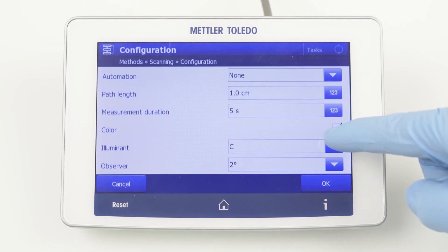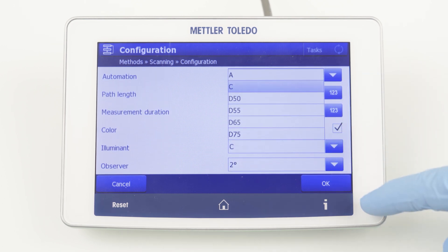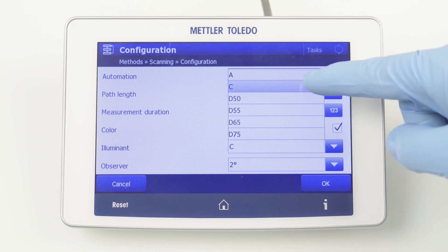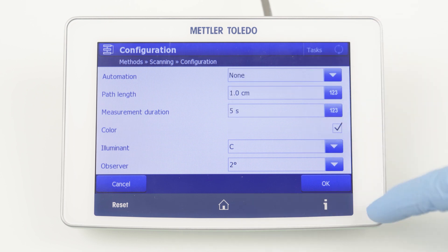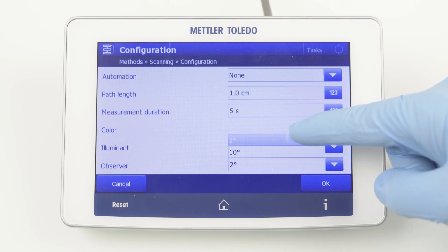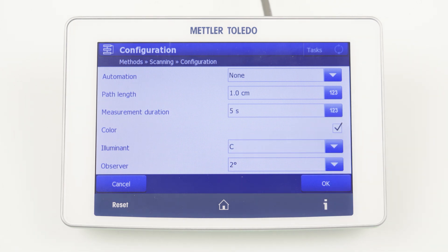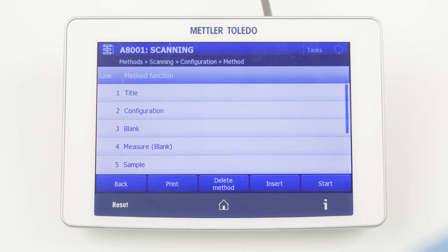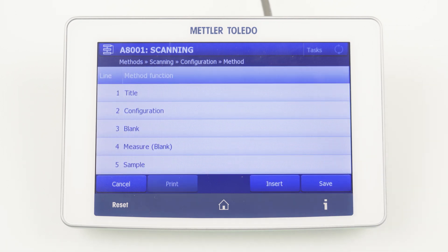For scan-based color scales, you can select between various illuminants and observers. Most of the time, however, illuminant C and observer 2 degree are used and do not need to be changed. By confirming the input, the method editor is shown with predefined method functions.